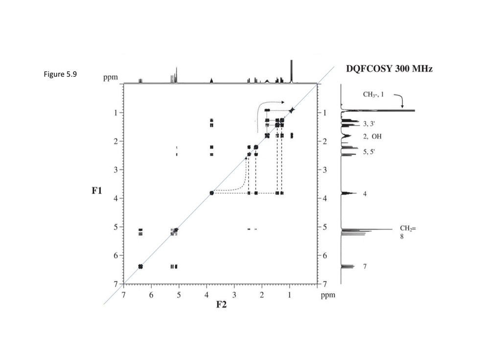We will plot the spectrum on a square. The diagonal is the one-dimensional spectrum without intensity, and then the cross peaks indicate all of the protons that are coupled with each other. The cross peaks should be reflected across the diagonal. Any deviation from this reflection may indicate noise, and that gives us a clue that we may be able to ignore some peaks if they are not reflected.